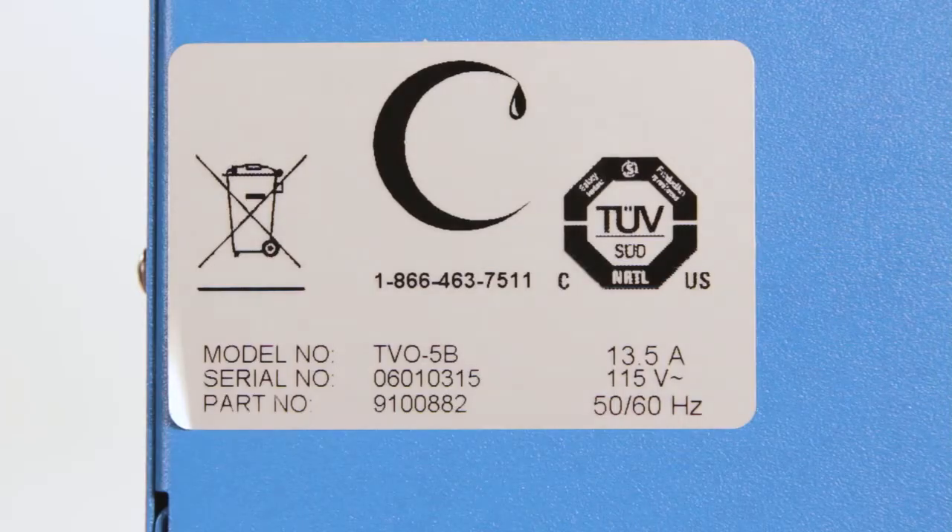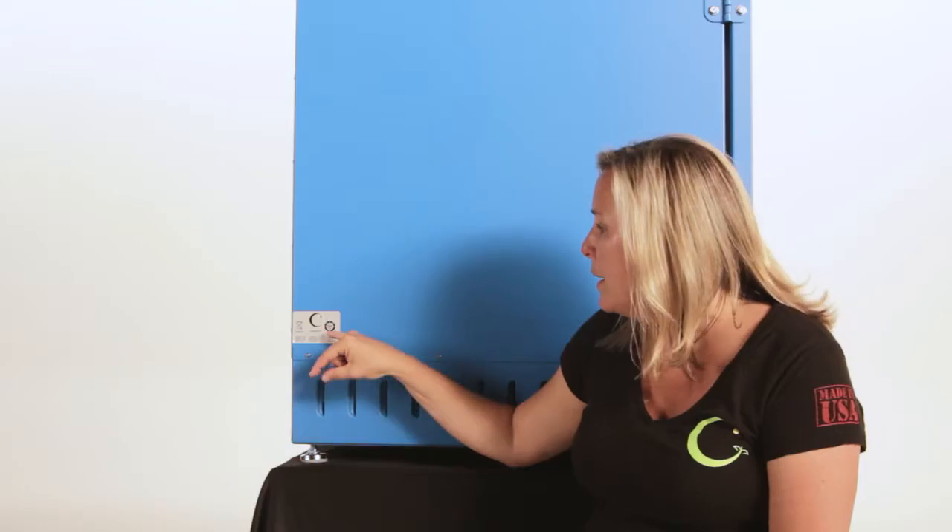I'm really excited about this feature. As this industry continues to grow, more and more city municipalities and fire marshals are requiring that the equipment that goes inside processing labs be certified. When it comes to ovens, they're requiring certification for electrical safety. The new generation of Cascade Botanical TVO2s and TVO5s have been inspected and approved for electrical safety by the nationally recognized test lab TUV.